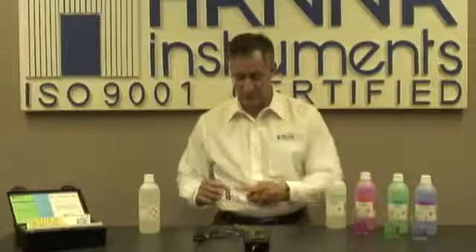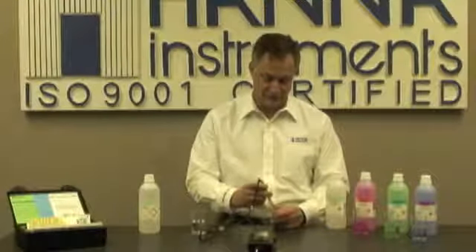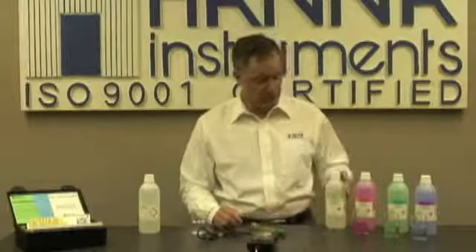One final tip: before you put your meter away, it's very important to keep your probe conditioned. What I like to do is take a little bit of storage solution, pour a little bit into the cap, and put the cap back on the electrode — and it's good to go for the next time. If you don't have a storage solution, again, it's okay to use a buffer.